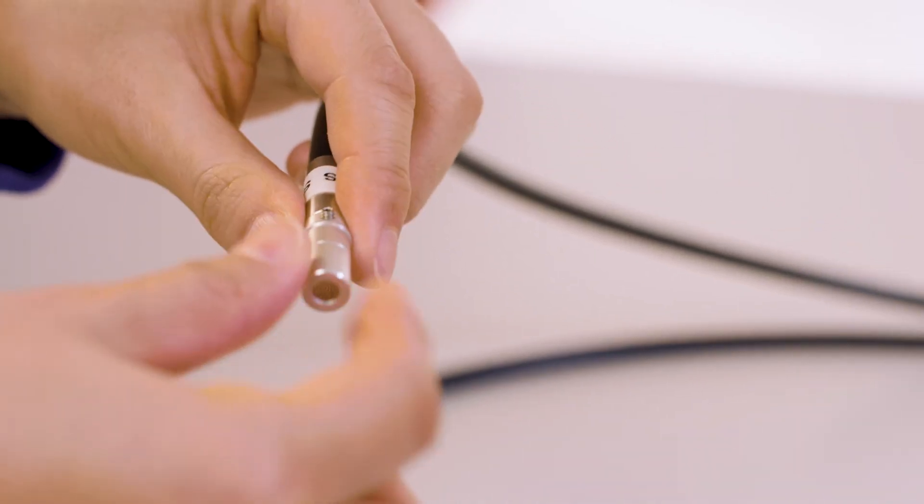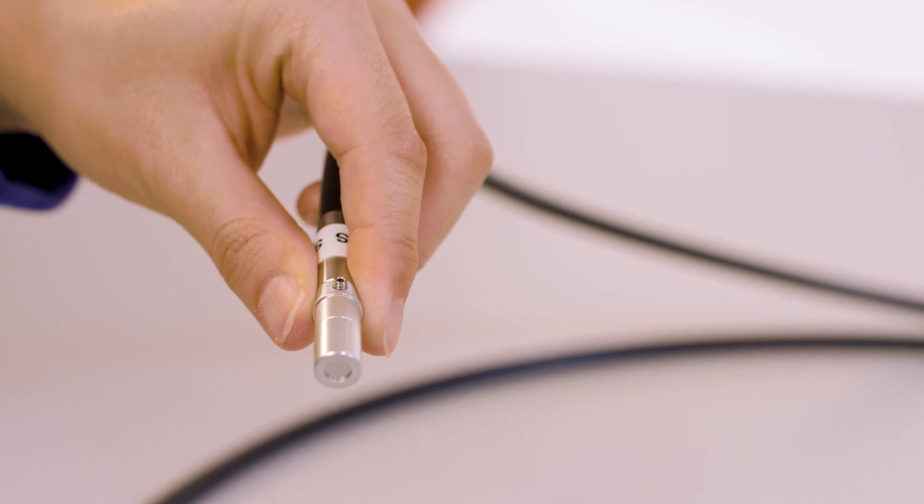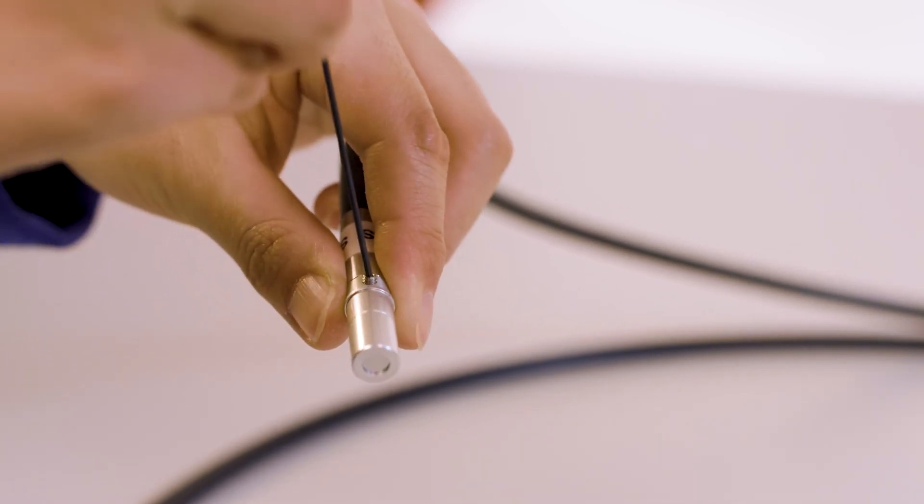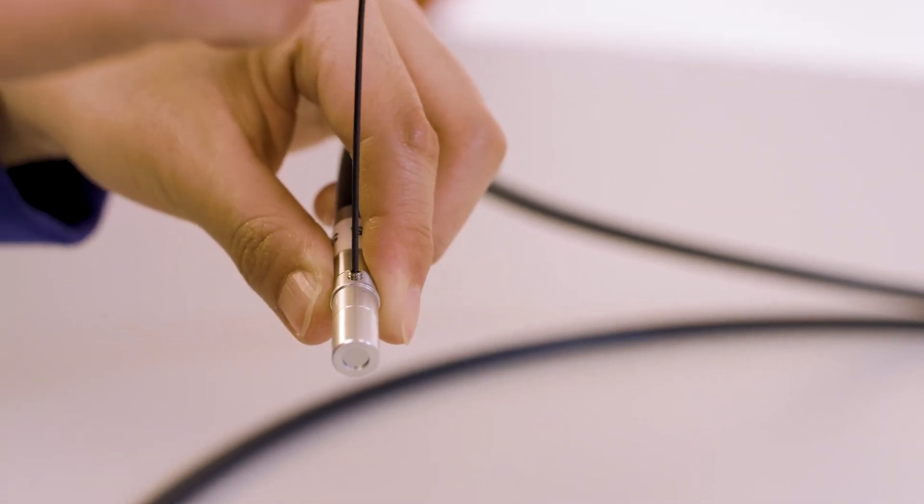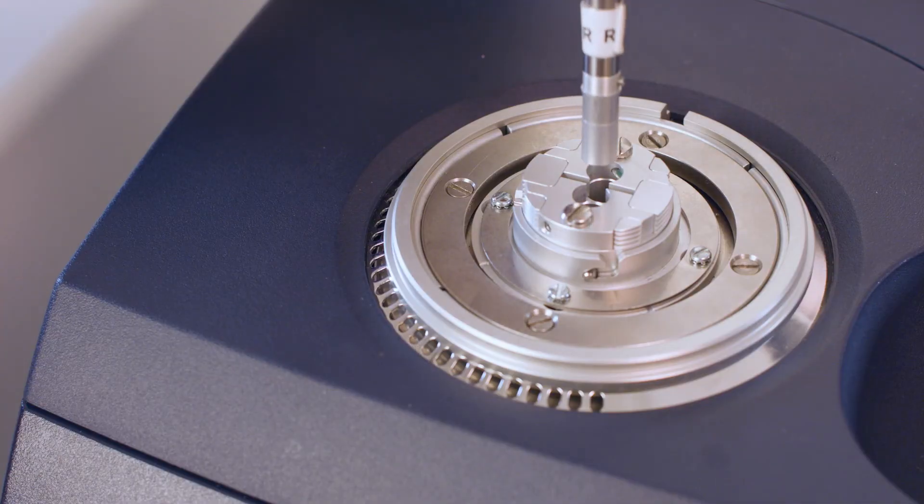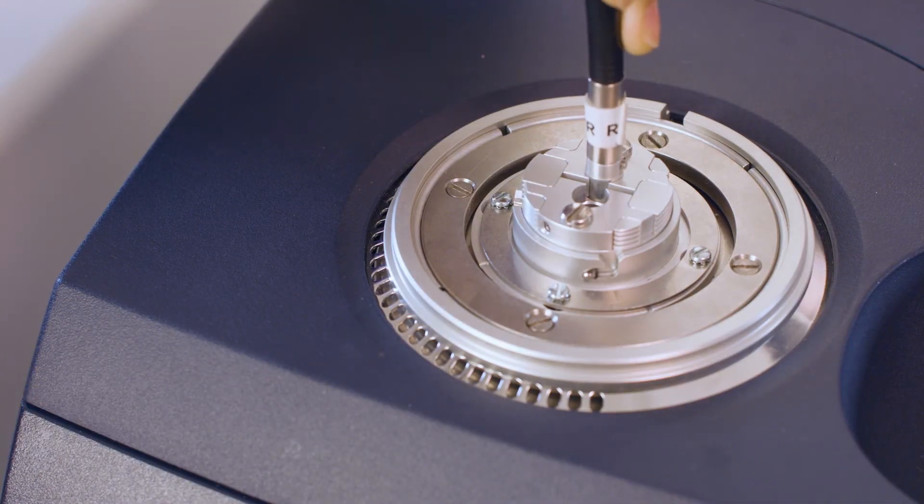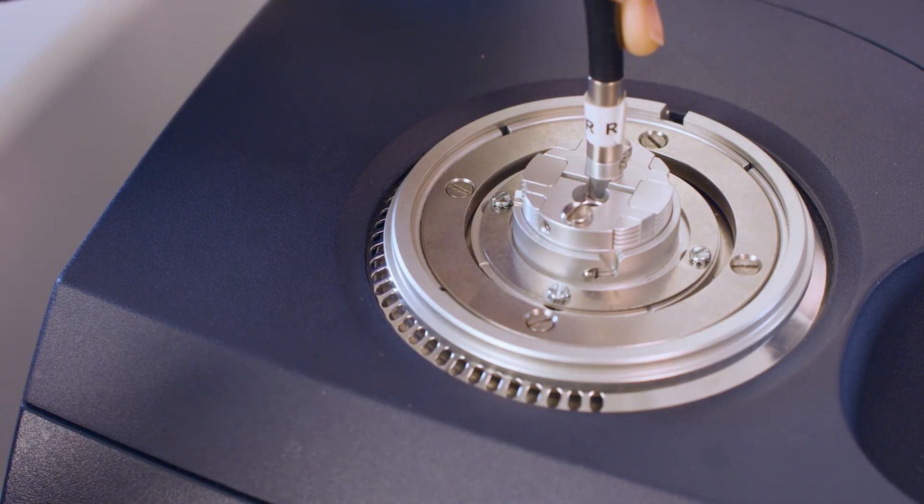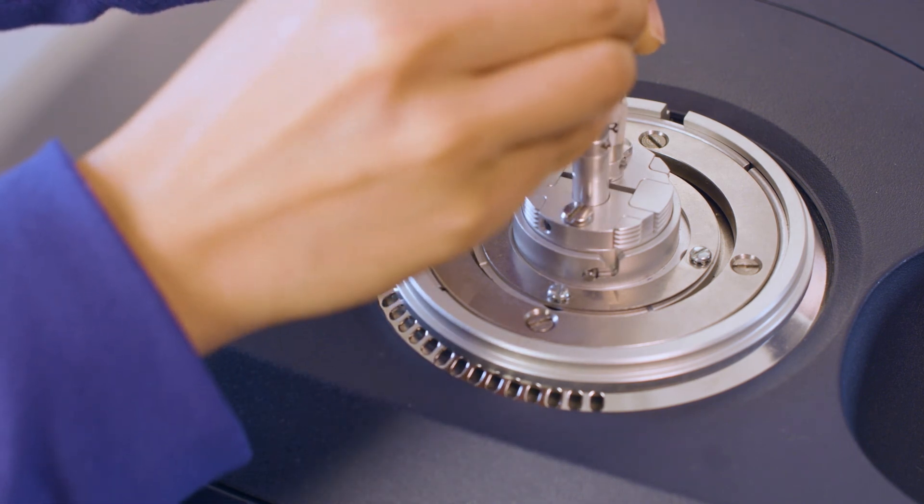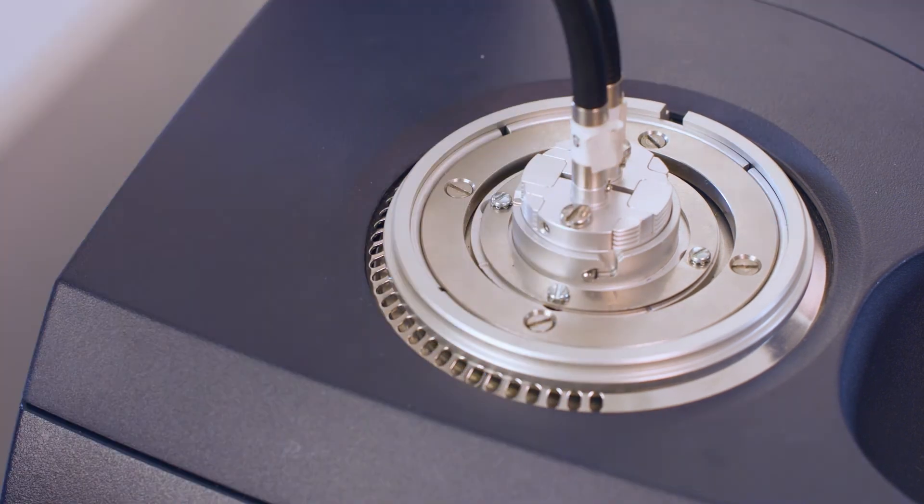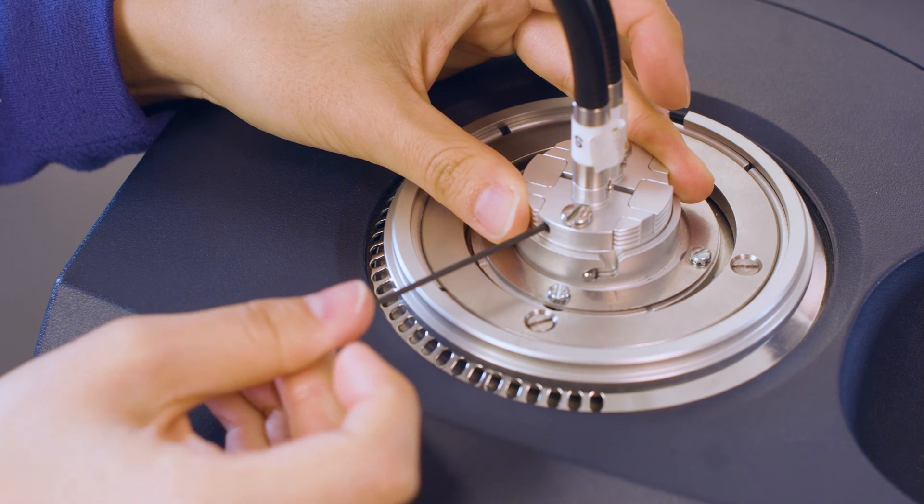Mount the filter holder to the end of the light guide arm. Tighten the set screws to keep them in place. Insert the light guide arms into the reference and sample holes in the light guide adapter until they bottom out. Tighten the set screws to hold them in place.